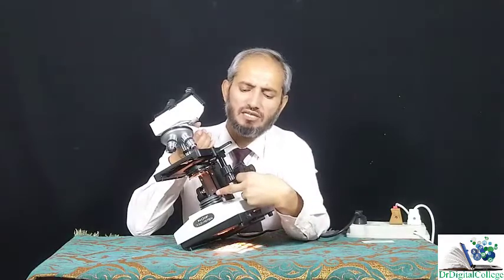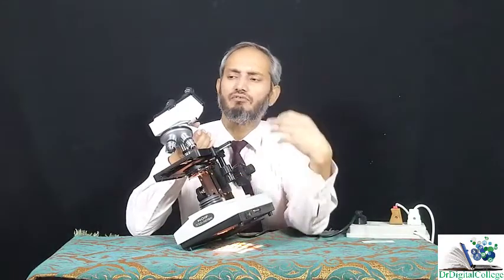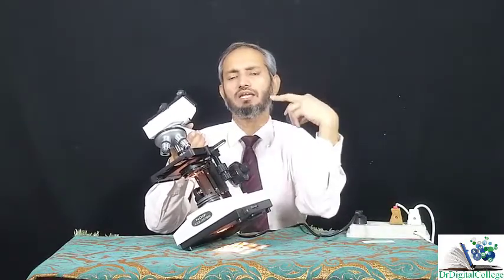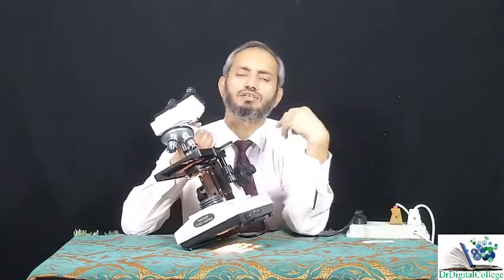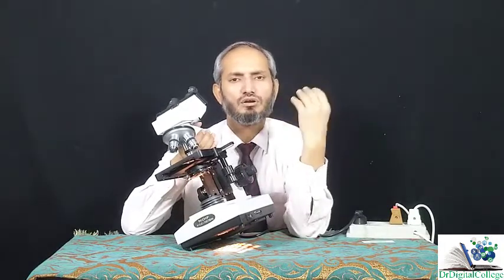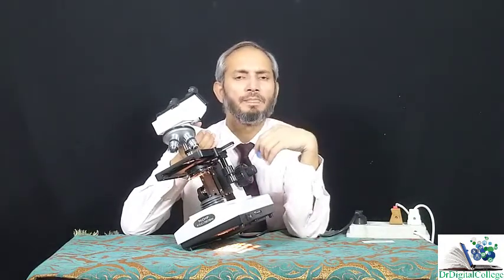Because in this light, there are some UV rays. And when you are directly observing, this light is going into your eye and it is hitting your retina. And the UV rays are mutagenic. They can cause mutation, they can cause cancer, they can damage your retina.